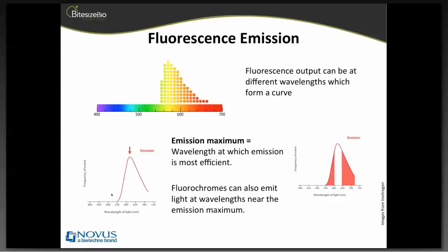So you're actually best to put in some beads. You can get beads where you know exactly how many beads per mil you have. So you add those to a known amount of your sample. If you gate on those and save them to a certain number, then you can do some maths to work out how many cells per mil you had.